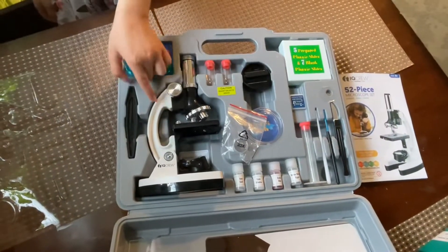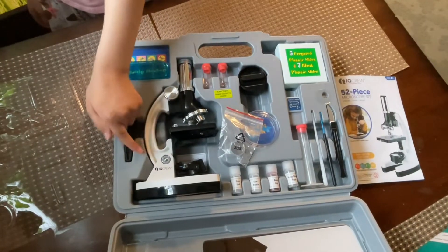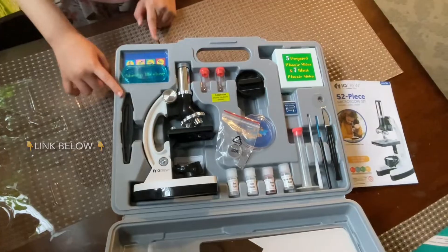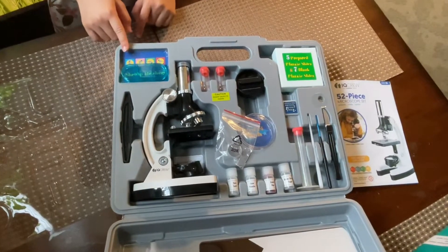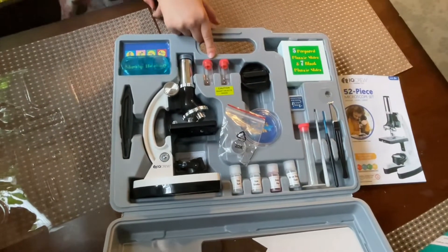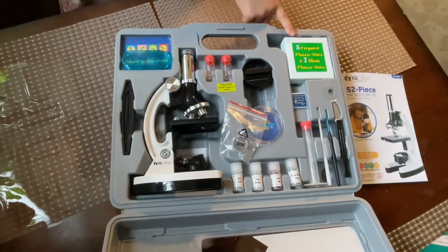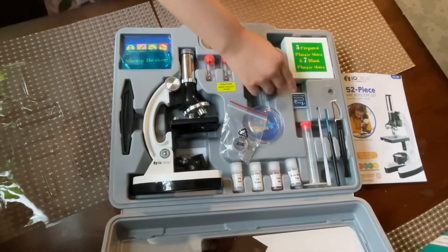Here's the microscope. I got a white one but there's also a black one on Amazon. These are the tweezers, shrimp hatchery, experiment, collecting vials, micro slicer. These are the slides and the labels.